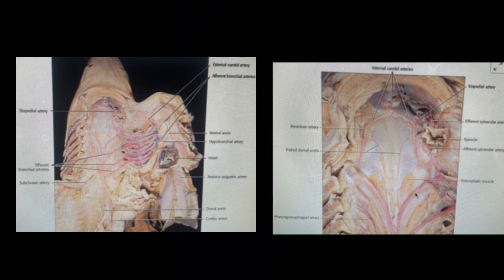The first branch is the lateral artery, which feeds into muscles. Second is the ventral lateral artery, which also does the same. And then the third is the anterior epigastric artery, which brings blood down to the ab muscles. At almost the exact point where the ventrolateral artery rises, the subclavian continues deep into the brachial artery, supplying the tissues of the pectoral fin and the surrounding area.